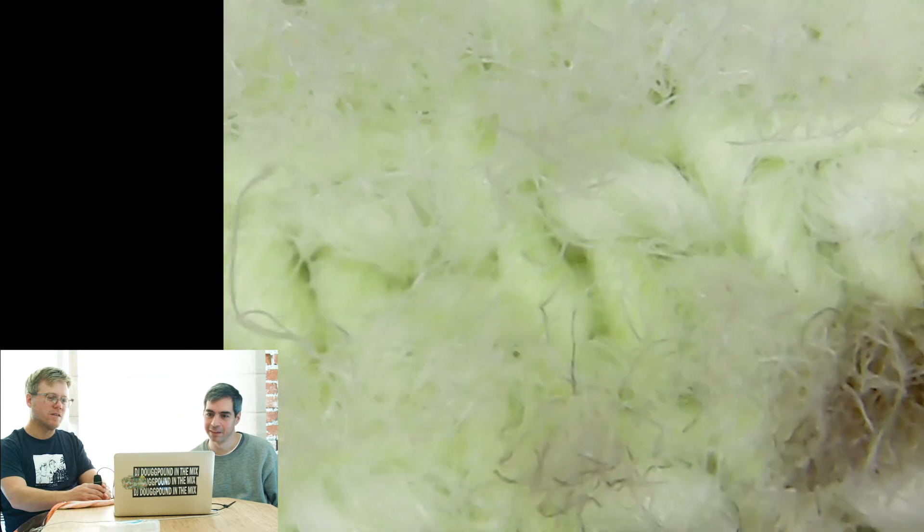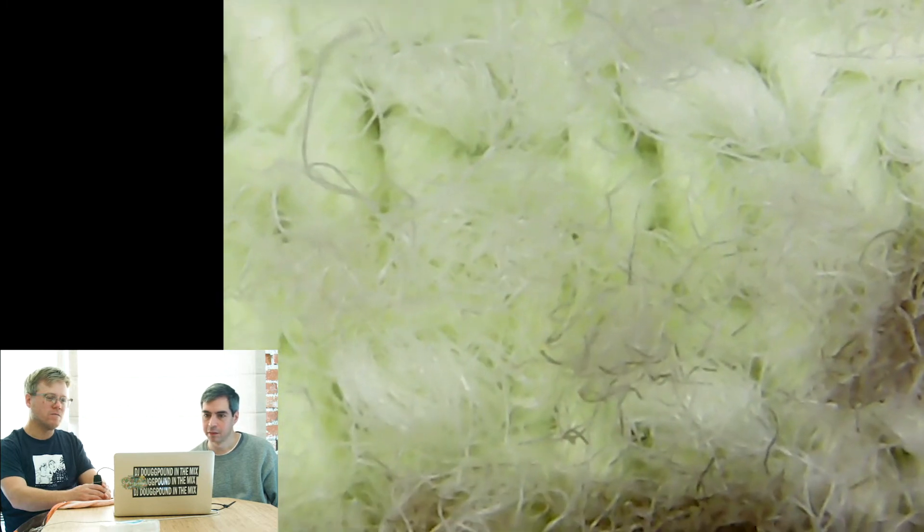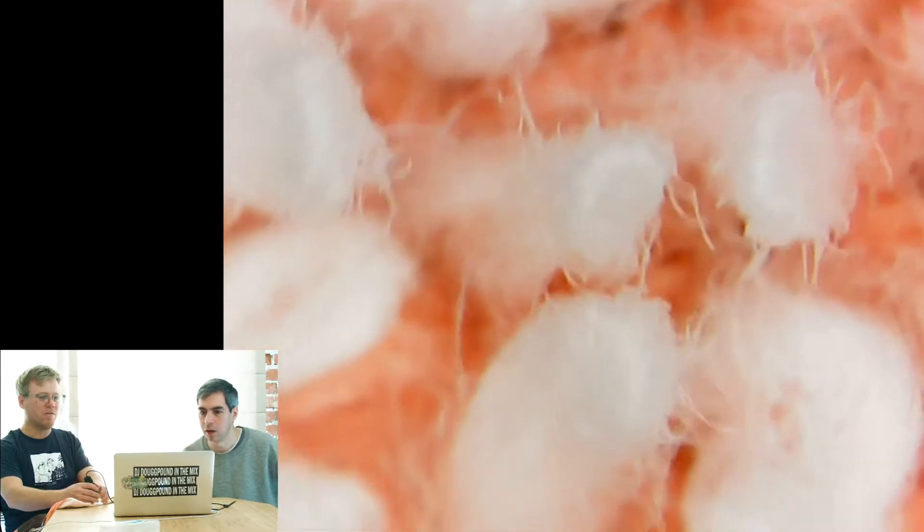Well, this top part just looks kind of like the woven fabric we've seen time and time again. We've looked at a lot of fabrics, and I was curious: what does terrycloth look like up close? The bottom part — we might be able to see the raised terrycloth.